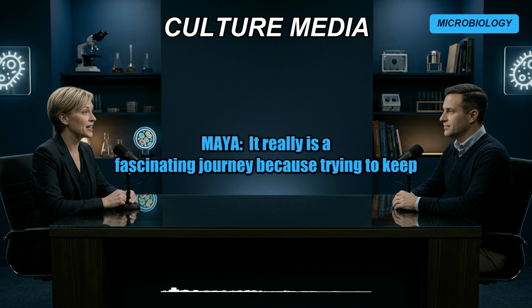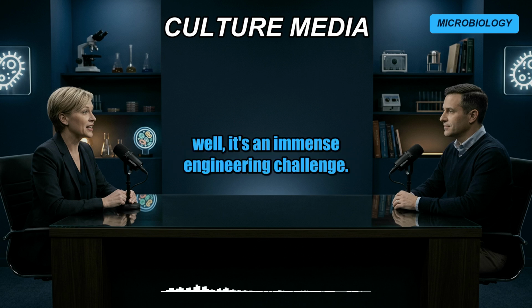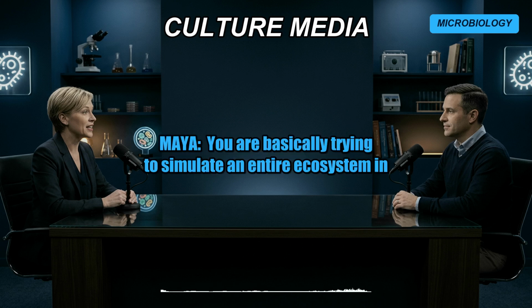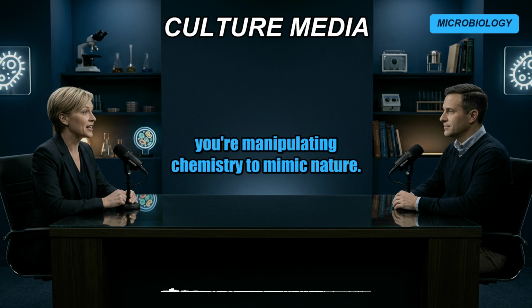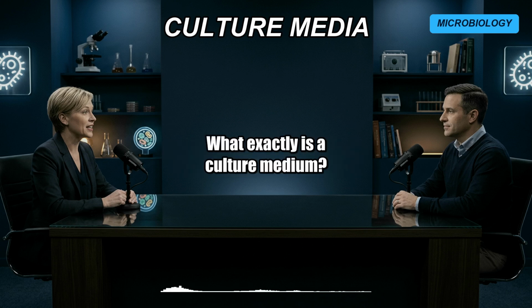It really is a fascinating journey because trying to keep a microbe alive outside of its natural environment is, well, an immense engineering challenge. Oh, I can imagine. You are basically trying to simulate an entire ecosystem in a little plastic dish. You're manipulating chemistry to mimic nature. Okay, let's unpack this. What exactly is a culture medium?